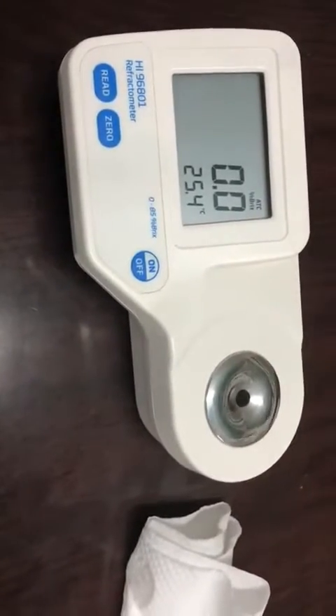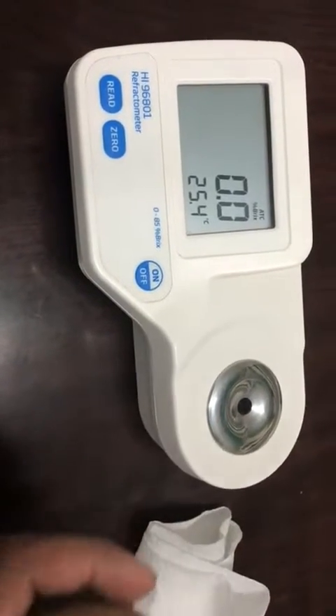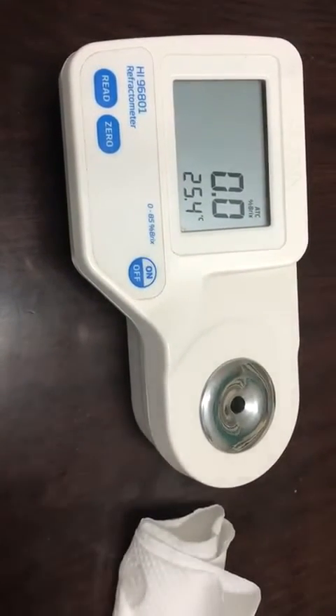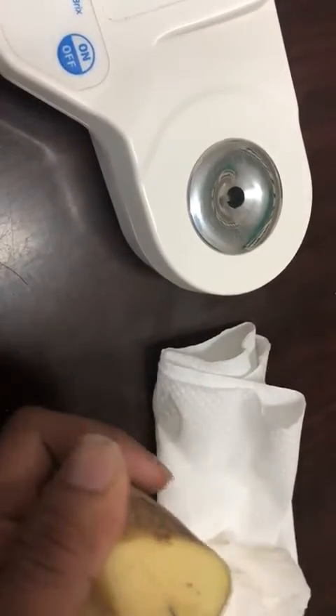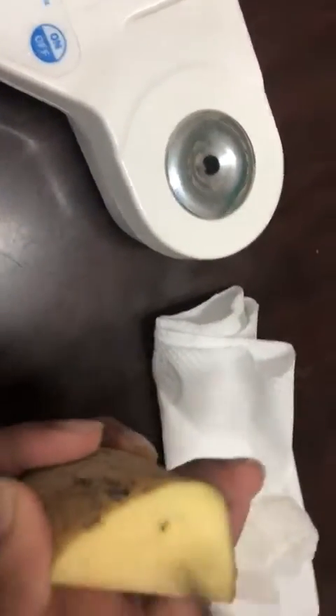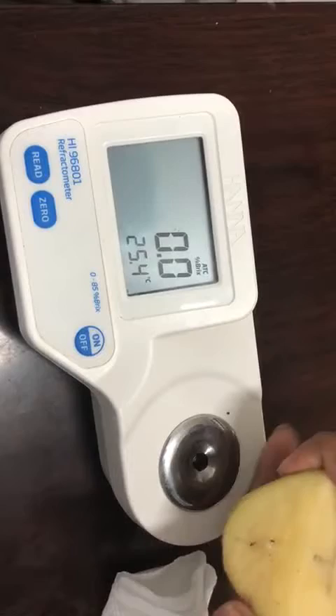Now we take a potato to test its sucrose content. For that, add a drop of its juice and then read the value.